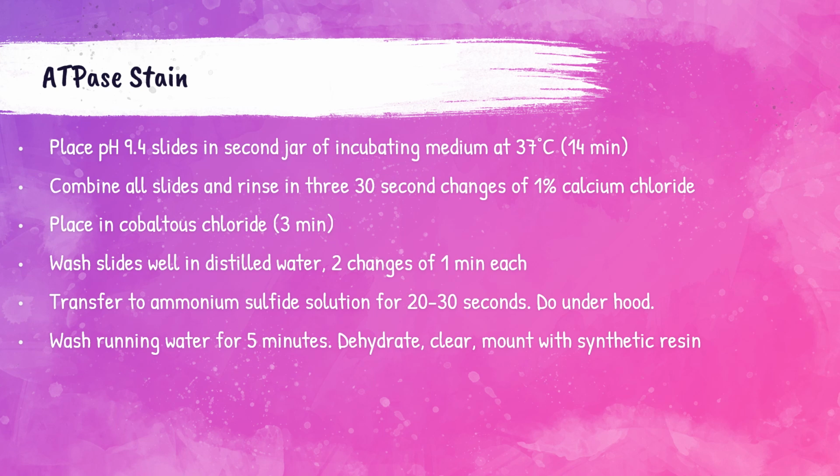So I realize, especially when explaining this procedure, that it's kind of complicated because there are different slides. So make sure when you're doing this to follow your laboratory's SOP, which is your standard operating procedures, and make sure to do it step by step. Everything will be labeled there for you.